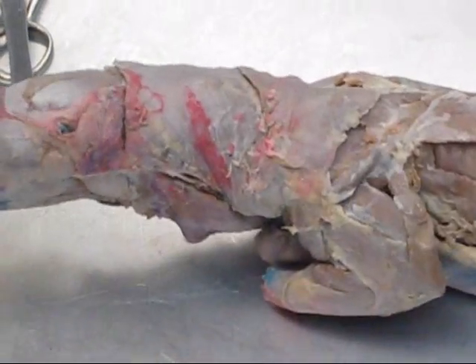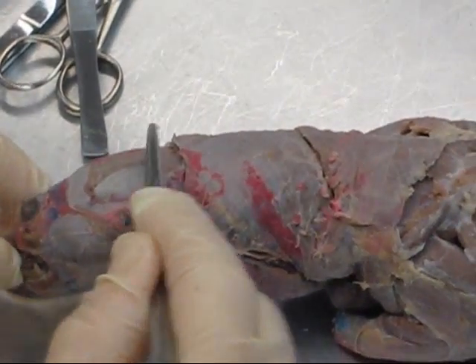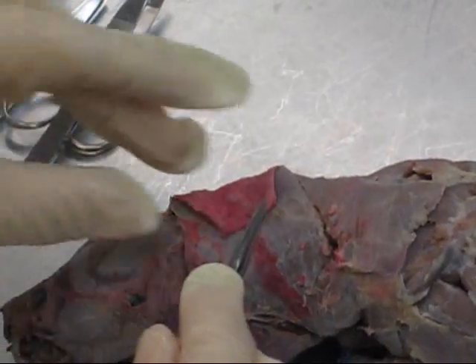We're going to start on the head and work our way downward. Right here we have the masseter. This is temporalis. Then, reflected back out of the way here, this very thin muscle that was like this originally was platysma.